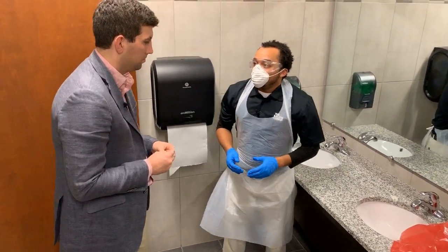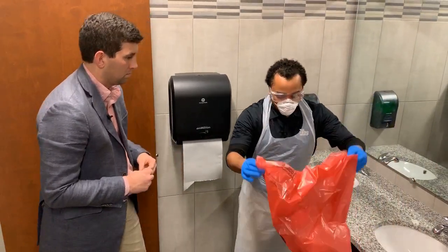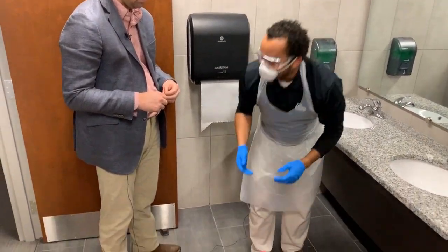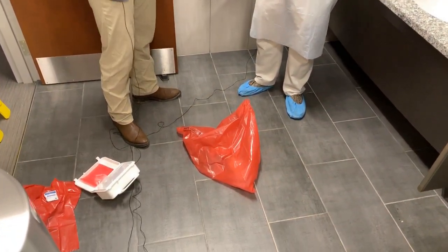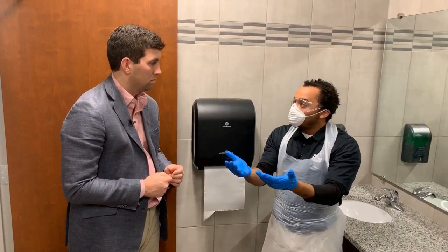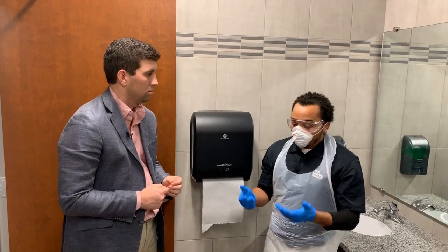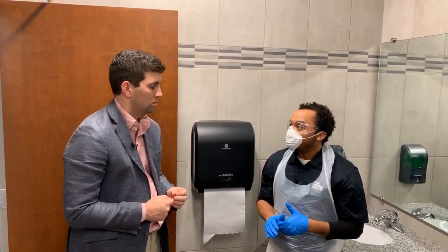All right, now what? Now, we're going to take the red biohazard bag and place it on the ground. And I'm going to start to declothe. I'm going to start from head to toe. Always remember head to toe, gloves being last. The reason gloves are last is because you always want to touch all the other parts of the PPE and make sure you take those off. And then the gloves will be lastly disposed of into the red biohazard bag.